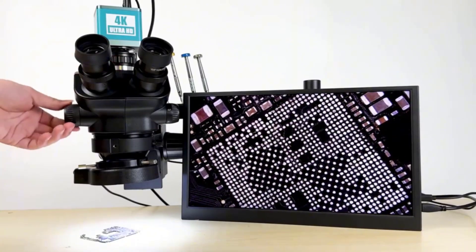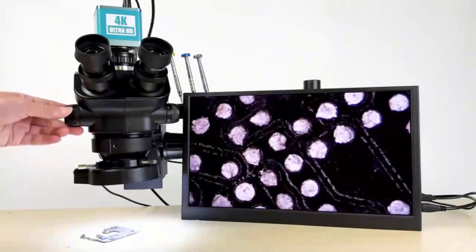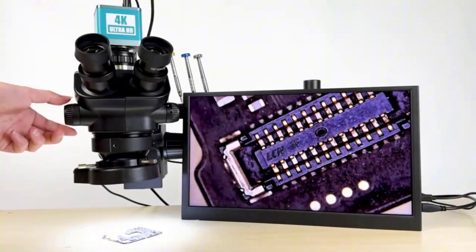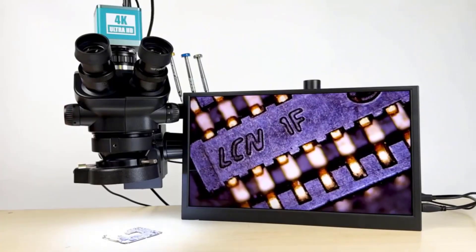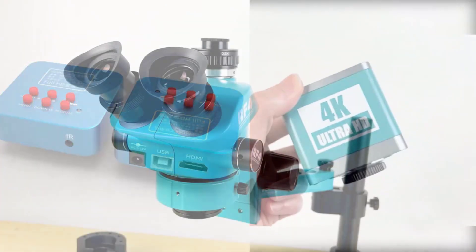This feature is especially useful in various fields such as biology, materials science, electronics, and quality control, where precise imaging and documentation are essential, whether for professional research, industrial inspection, or educational purposes. Stereo trinocular microscopes offer a powerful blend of magnification, clarity, and versatility.